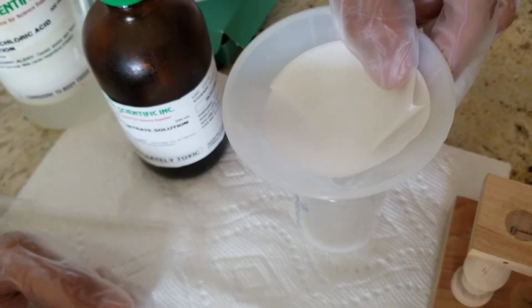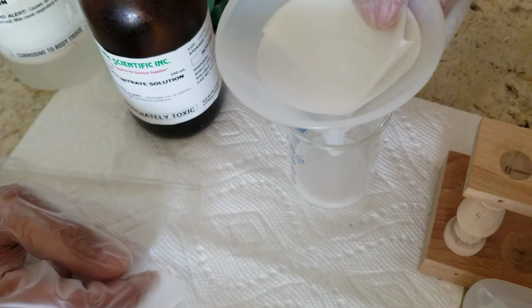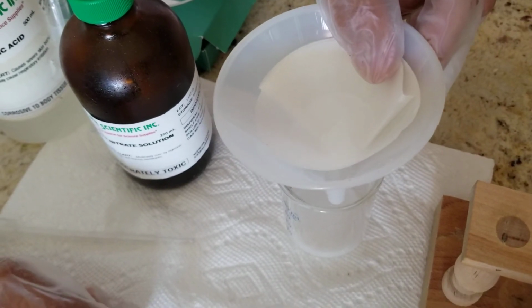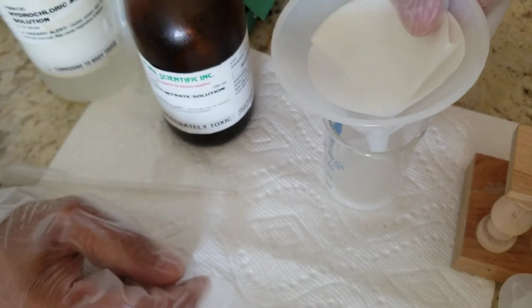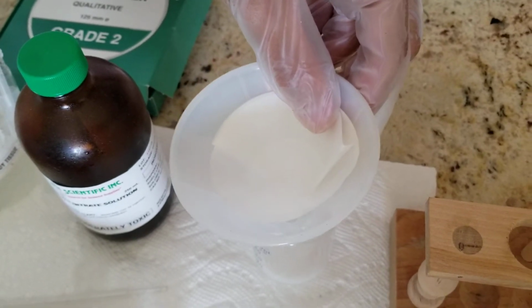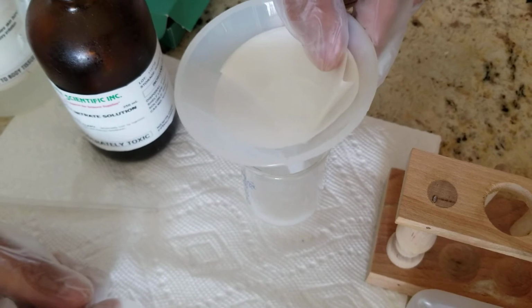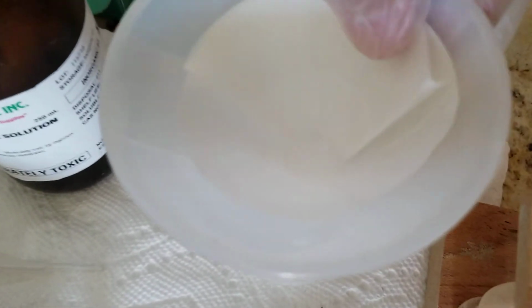So as we're waiting for this, consider the process of filtration. Are we separating it based on a physical or chemical property of the substance? That's something that we have discussed in class. We're almost there. Just trying to encourage the filtration to happen much quicker.